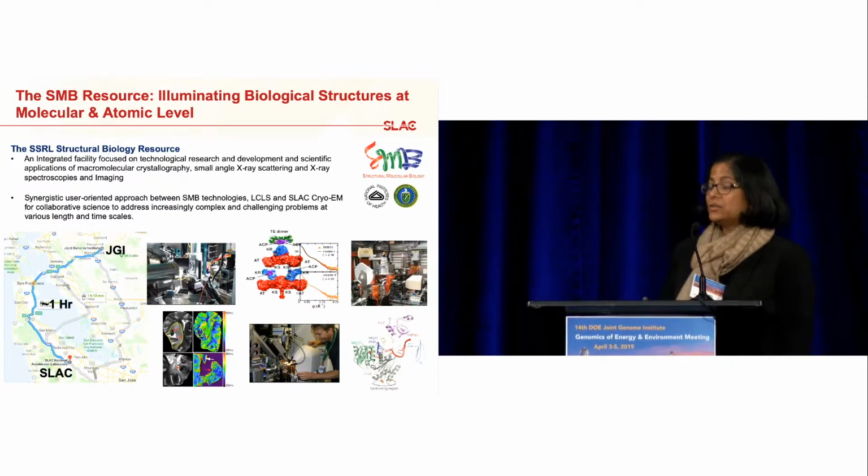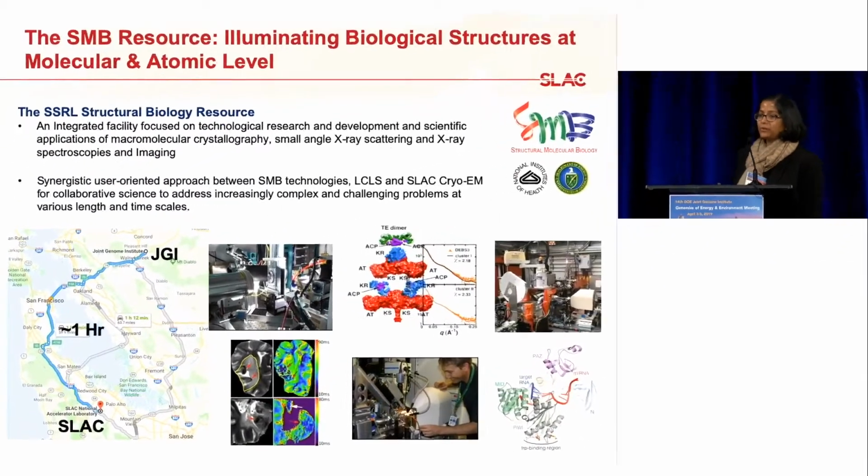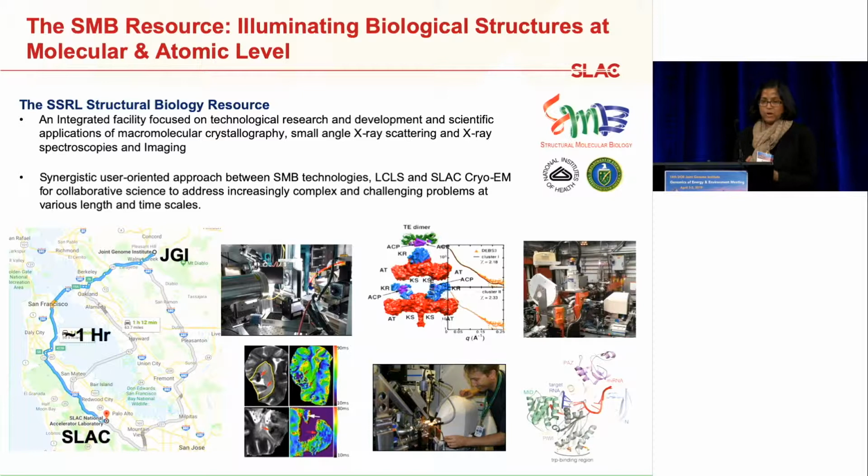So we are in the business of understanding the atomic and molecular level structures of biomolecules. And we at the SMB group develop tools to specifically do macromolecular crystallography, small angle X-ray scattering, X-ray spectroscopy, and imaging. That's within the SMB group, but we also leverage other capabilities that are available at SLAC, such as the Cryo-EM facility and the LCLS-based XFEL macromolecular crystallography. So together, we bring a multi-technique approach towards studying macromolecules at the atomic and molecular levels.